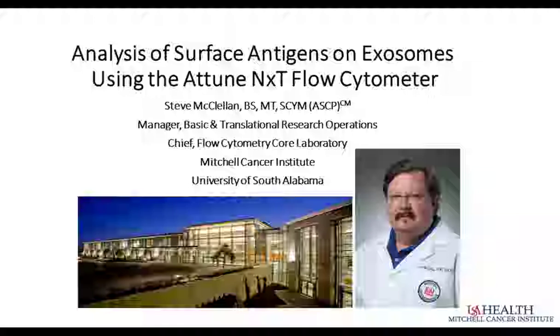Thank you. I would like to share with you some of our recent progress in using the Attune NXT to analyze surface markers on exosomes. Some of the first published reports on exosomes date back to the mid-'80s, and the field actually began in the world of platelet biology and reticulocyte maturation. Since that time, the number of references in publications talking about exosomes has grown exponentially.